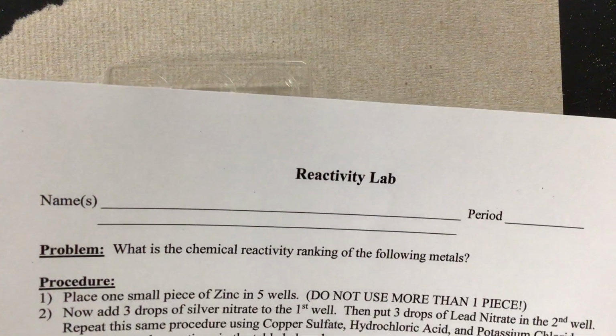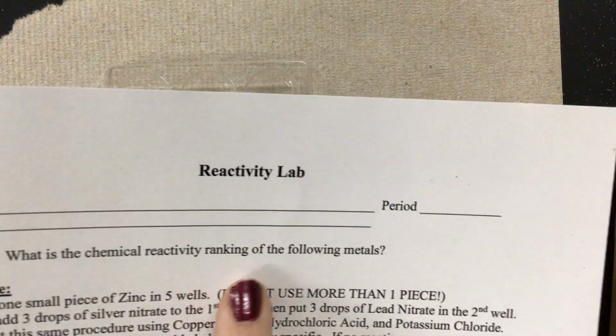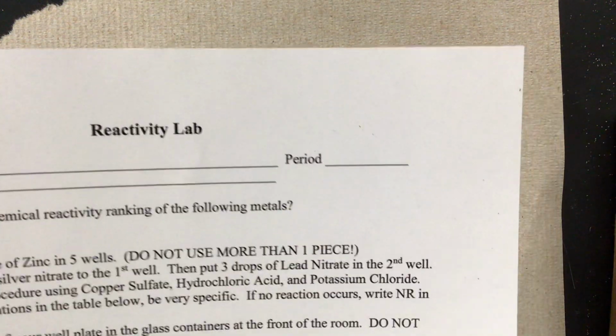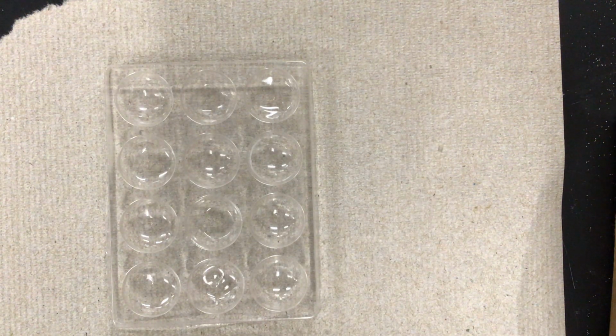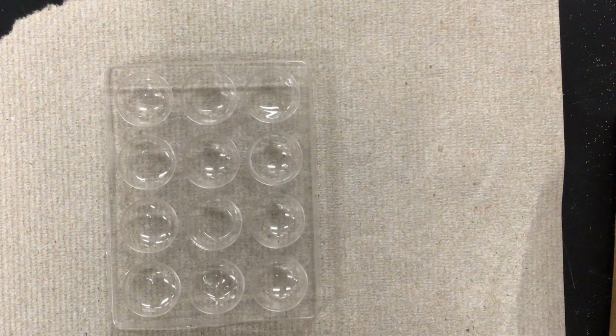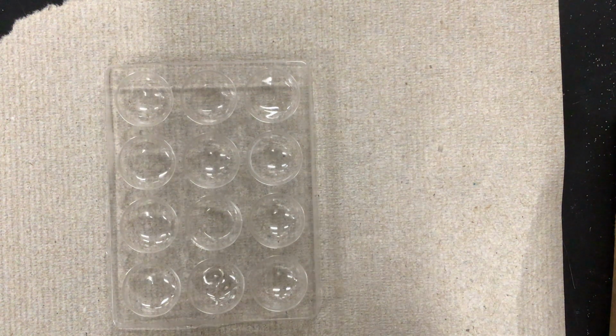Overall, the question that we're trying to answer is what is the chemical reactivity ranking for the metals? Or basically, which metal is the most reactive? That's what we're really trying to figure out. So again, this video is going to focus on iron.